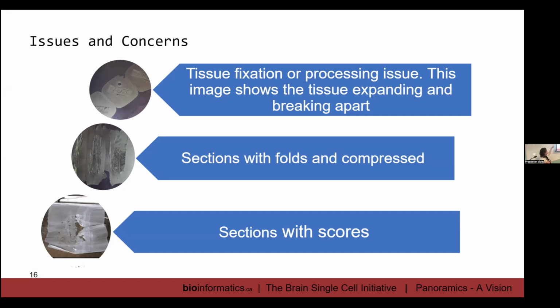So the top picture, those are actually processing issues. As soon as it touches the water bath, it'll actually expand and explode. The tissue will literally explode, like it'll just break apart and you can't pick up anything. So this is why I was saying that fixation is extremely important.